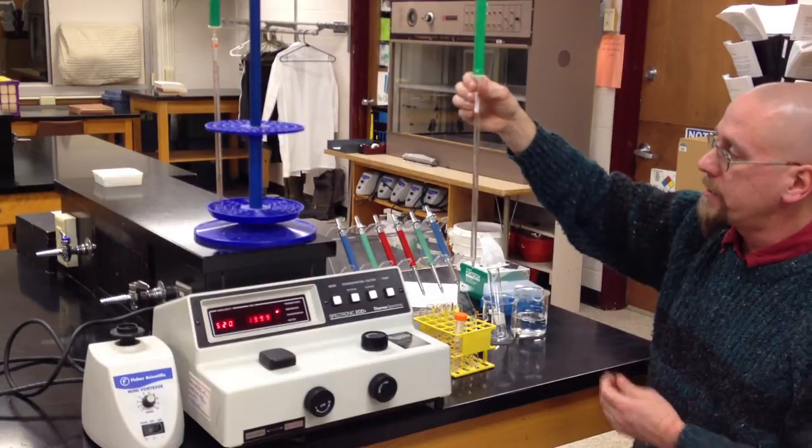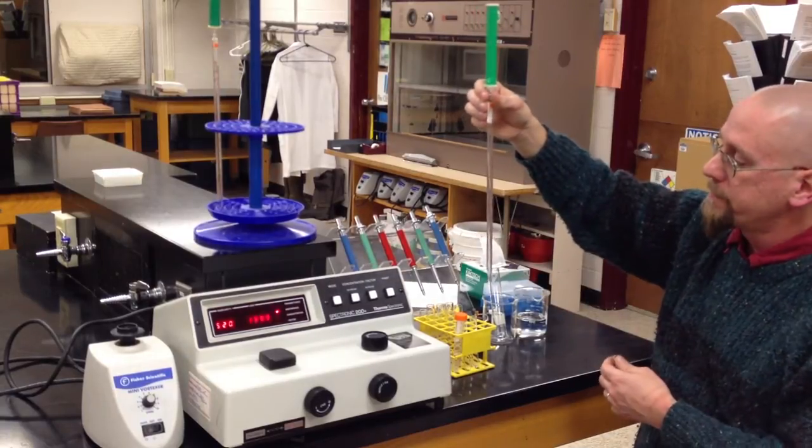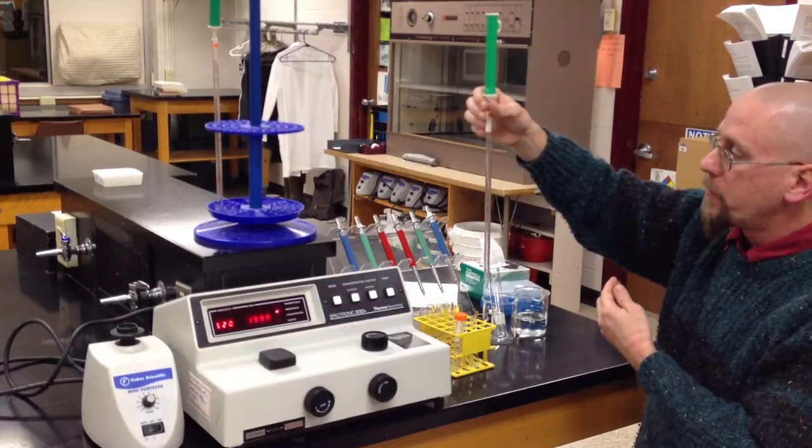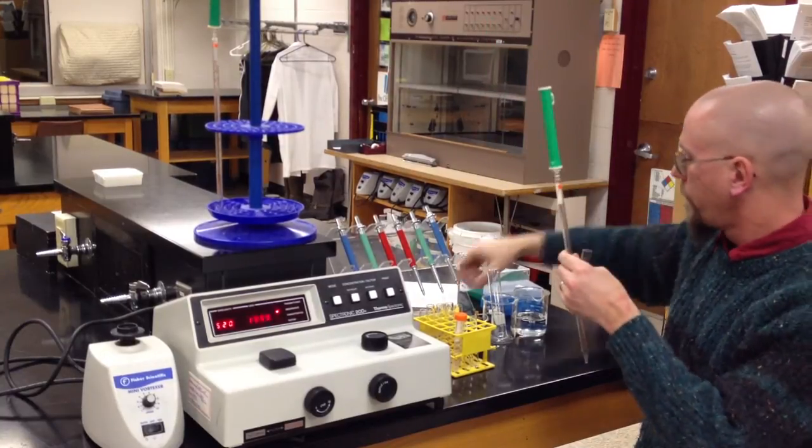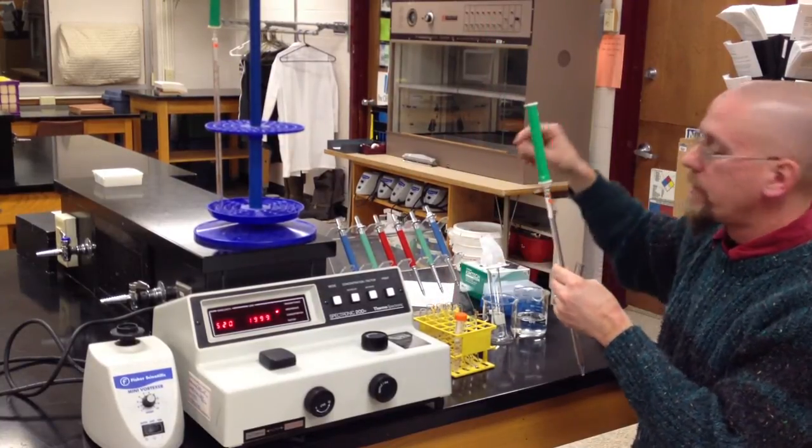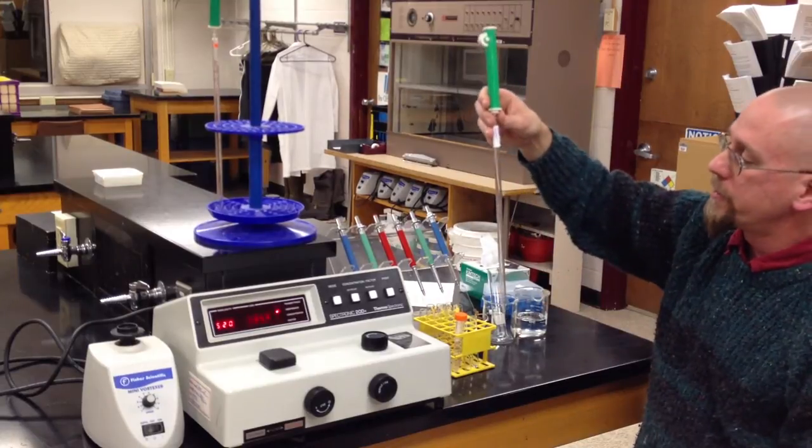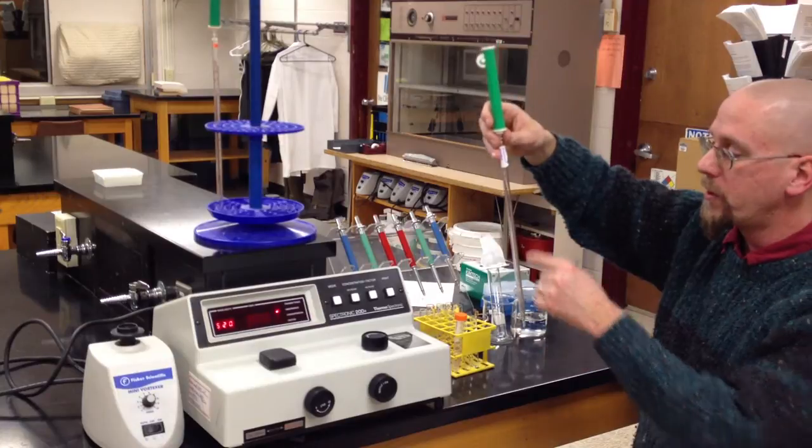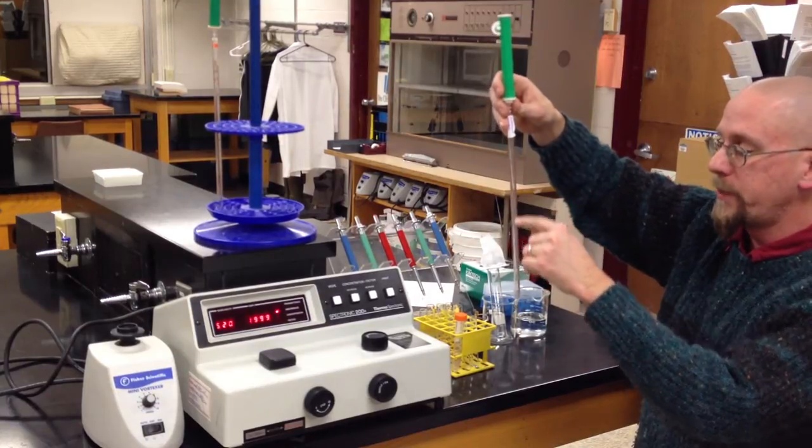You're going to deposit in here 5 milliliters of deionized water. These pipettes are 10 milliliter pipettes. They go from 10 at the bottom to 0 at the top. Whenever you use these pipettes, if you're going to deliver a certain volume, you always fill to the zero and dispense to your value.